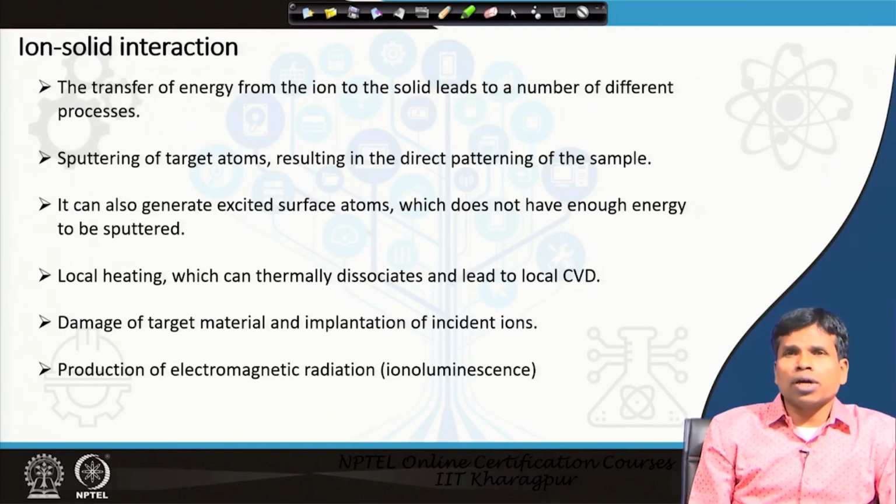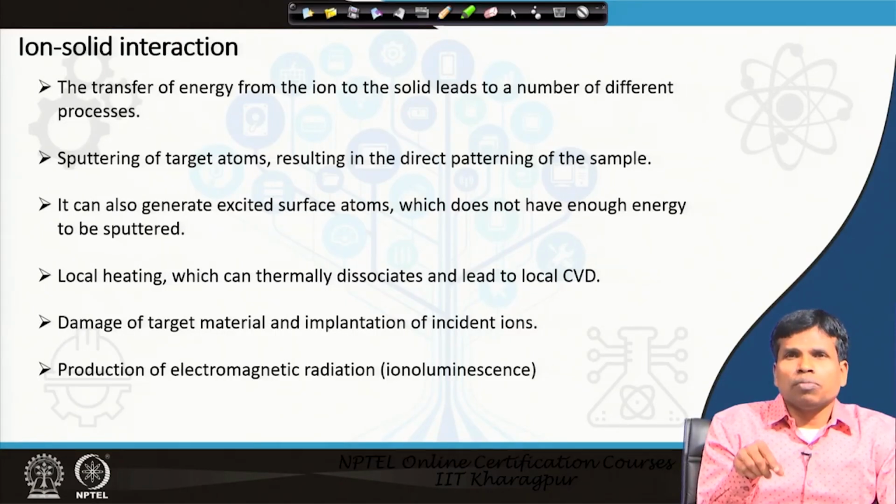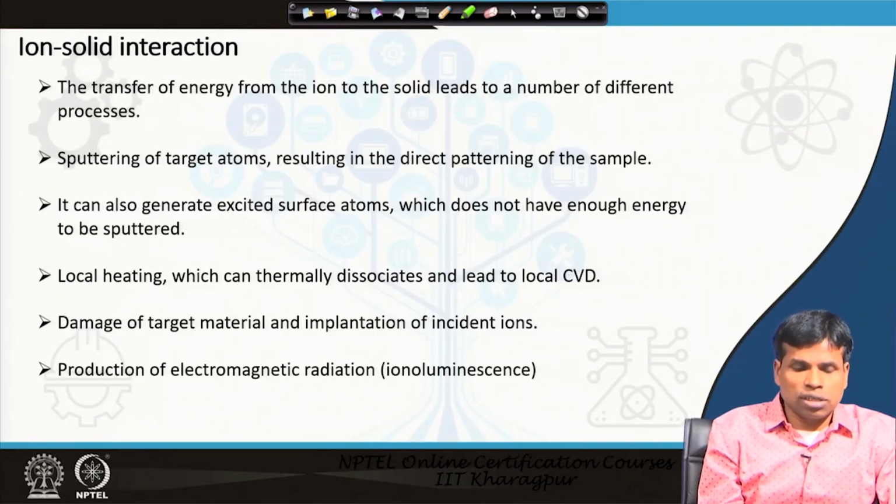So, in our ion microscope, a fine beam of ions bombards the solid surface of the specimen, and that leads to many different processes.